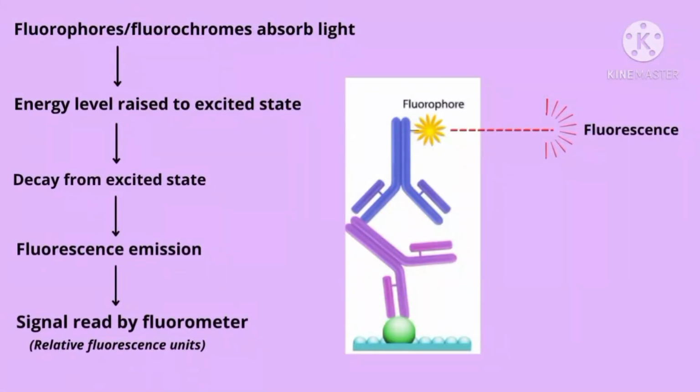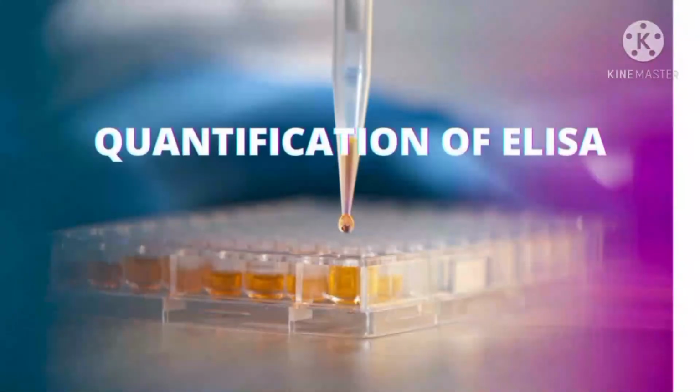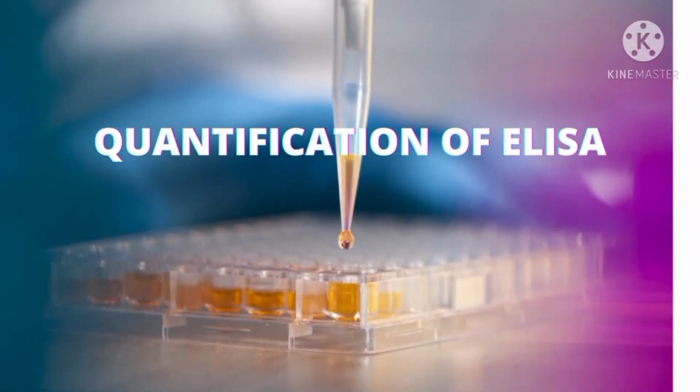Chemifluorescent assay. This assay is also enzyme based, but the generated product is fluorescent rather than colorimetric. Fluorescence occurs when certain molecules called fluorophores or fluorochromes absorb light. The light absorption raises the energy level to a brief excited state. As they decay from the excited state, they emit fluorescent light. A fluorometer can read the signal in relative fluorescence units, which is directly proportional to the amount of analyte being measured.